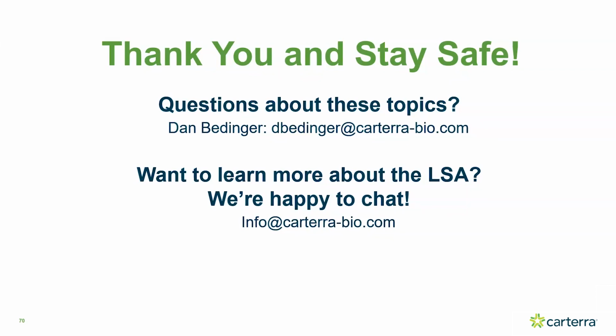Yeah, it does. What we're measuring is the change of effective refractive index at the surface. Because on these matrix and these chips everything's randomly oriented, most proteins give a very good mass to SPR signal response. So if you immobilize or capture a certain level of antibody, using the mass ratios between your ligand and analyte, you can estimate the observed stoichiometry of that interaction.